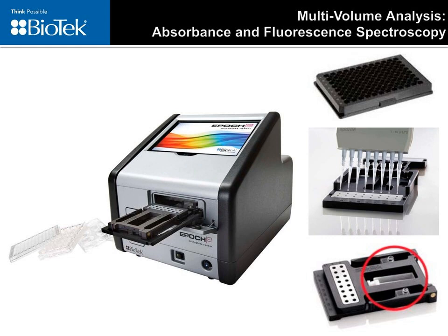The 96 well density microplate format is the most commonly used format, and the assays performed are typically biochemical or cell-based in nature and can cover a broad range of analytical methods as well as a variety of detection methods, which include absorbance, chemiluminescence, and fluorescence modes. However, the instruments have been used in a range of industry areas such as food, water, and petrochemical analysis as well. Historically, the most common assay performed is the ELISA assay, which most folks are familiar with.